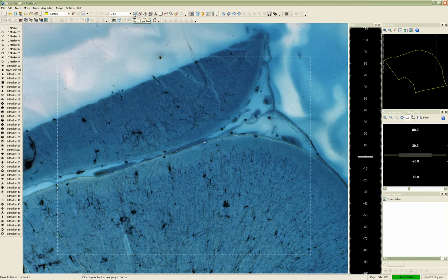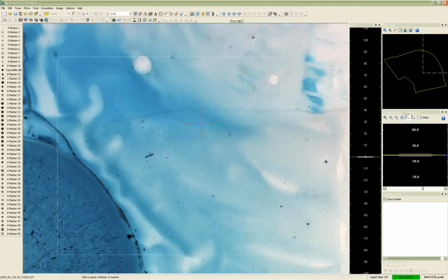Okay, so you can do a number of things once you have a contour that bounds your region of interest. You can do a meander scan through your entire contour so that if you want to identify candidate cells, you can make sure that you examine all parts of your contour. Additionally, you can just select markers and place them near cells that look interesting to you.